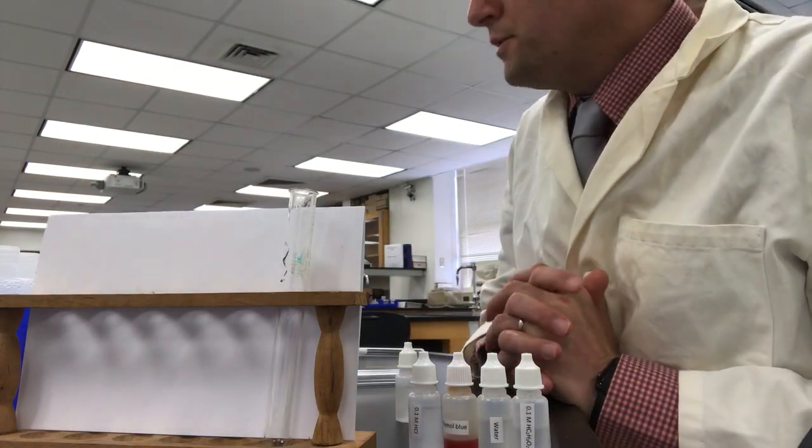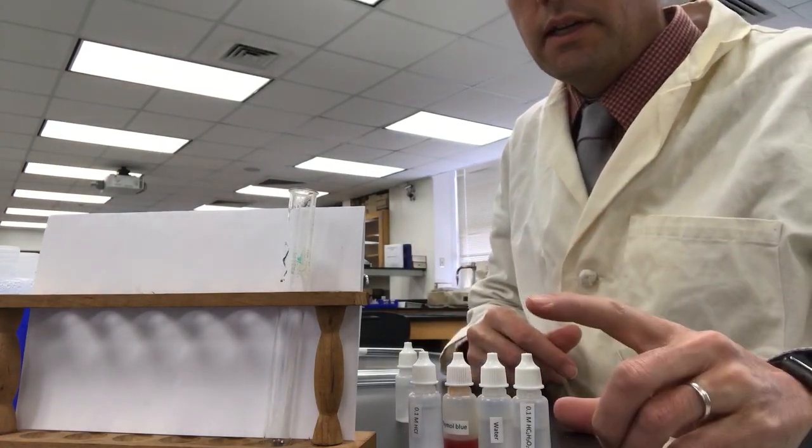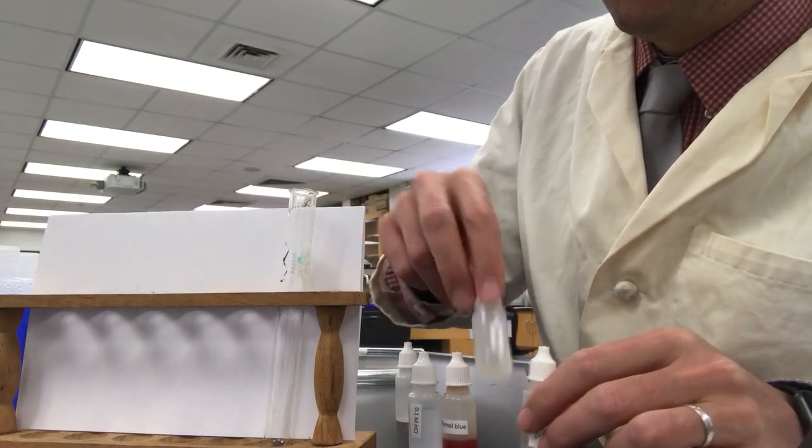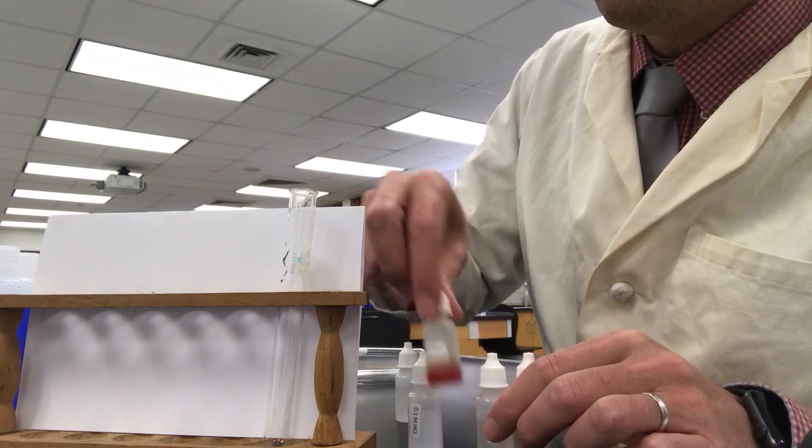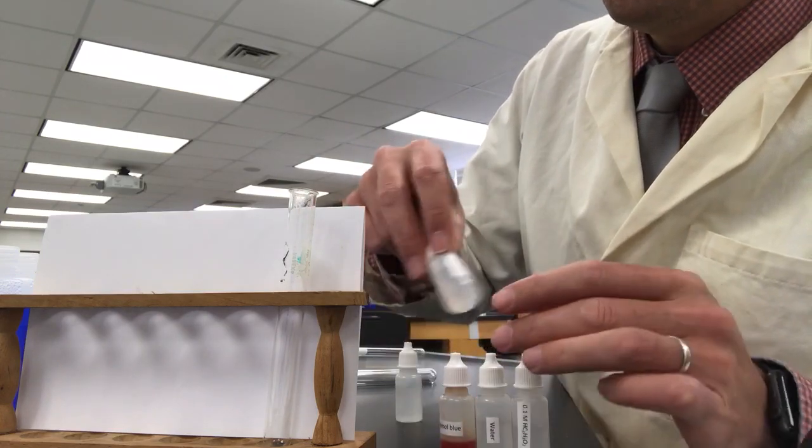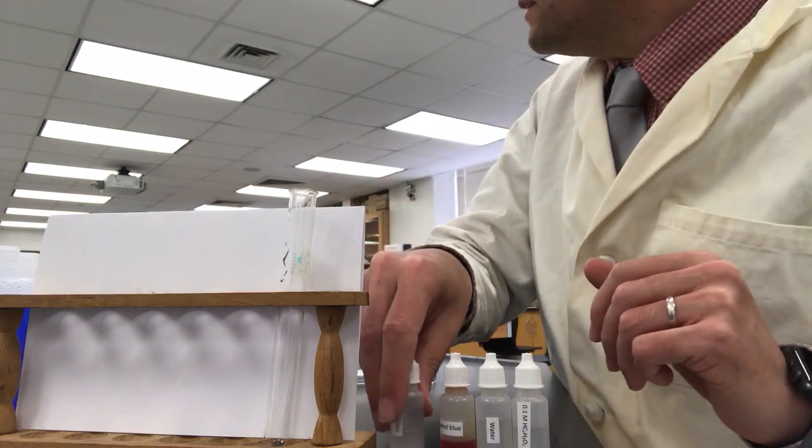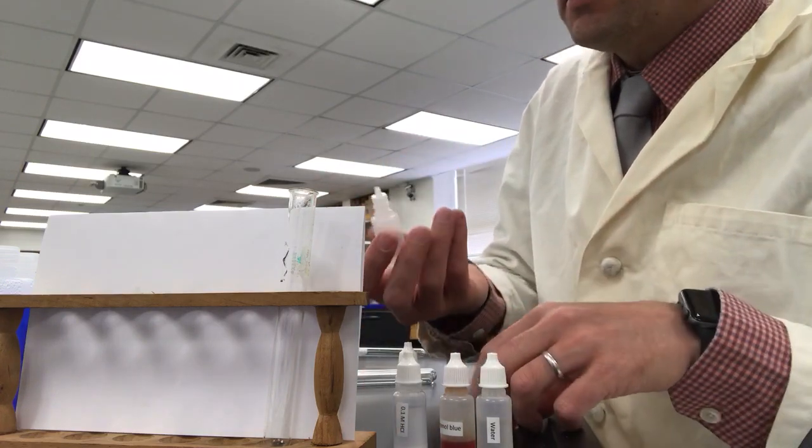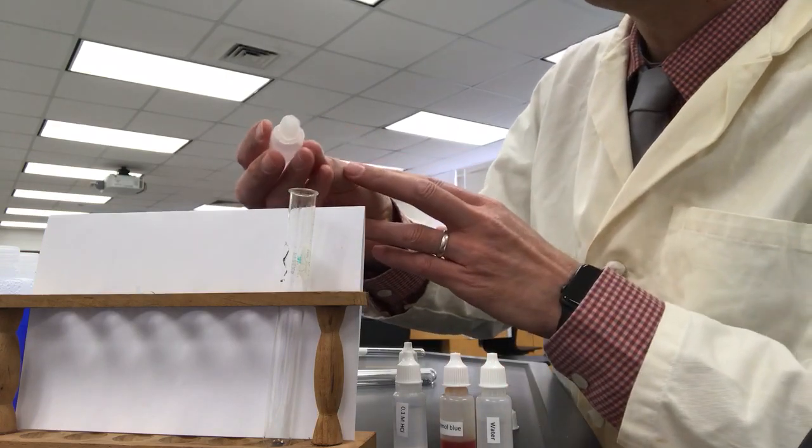This is solution B2 located in table 3. We're going to add 10 drops of acetic acid, 10 drops of water, one of thymol blue indicator, and we're going to add hydrochloric acid until there's no additional color change and we'll look at the colors in between.